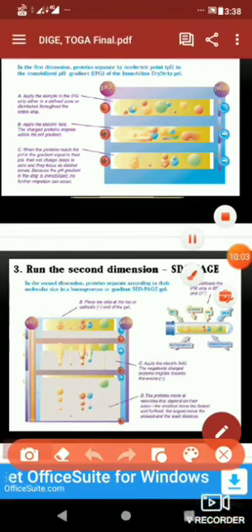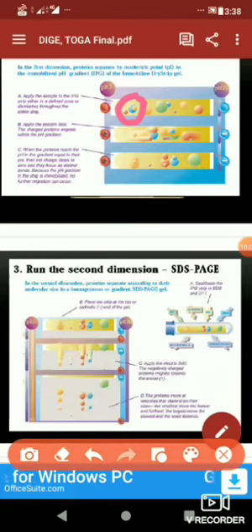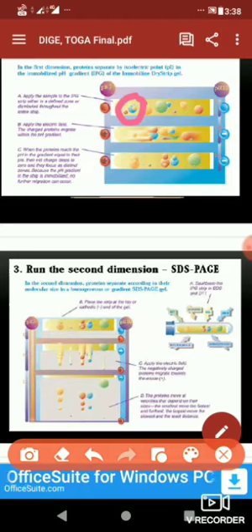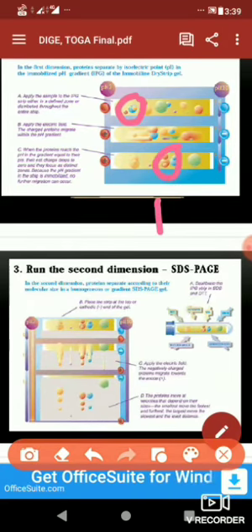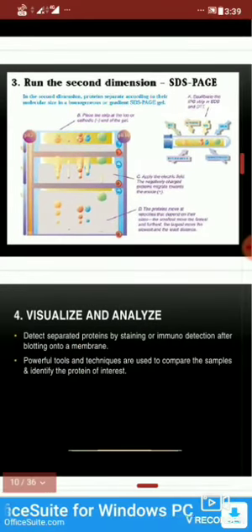Now here you can see, just look at this spot. There are two different proteins. Both of them are lying at the same spot. Normally, if you do SDS PAGE, you will think that in this spot, when you see it as a band, it will be a single band. You will think there is only one protein. But actually, you can see how many proteins? 1, 2, and very close by, there is another protein, which is the third protein. So this will never be resolved in a normal SDS PAGE gel. Similarly, here also you can see the same thing. So now let us see how it is resolved.